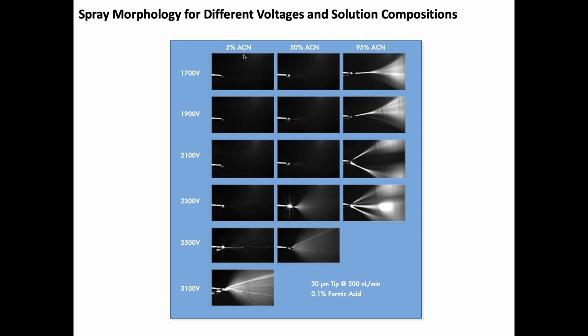This is important because, as I've really emphasized, electrospray allows the coupling of LC to a mass spec. In LC, though, you're typically running gradients, where you start off, for example, in a reverse phase system at very high aqueous or low organic content, and then you move up to high organic. And so your electrospray plume dynamics can change with time. It's just something to keep in mind.